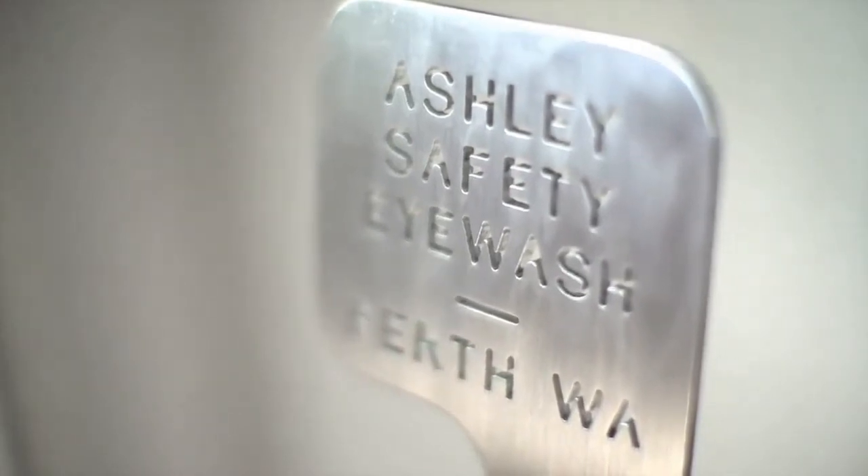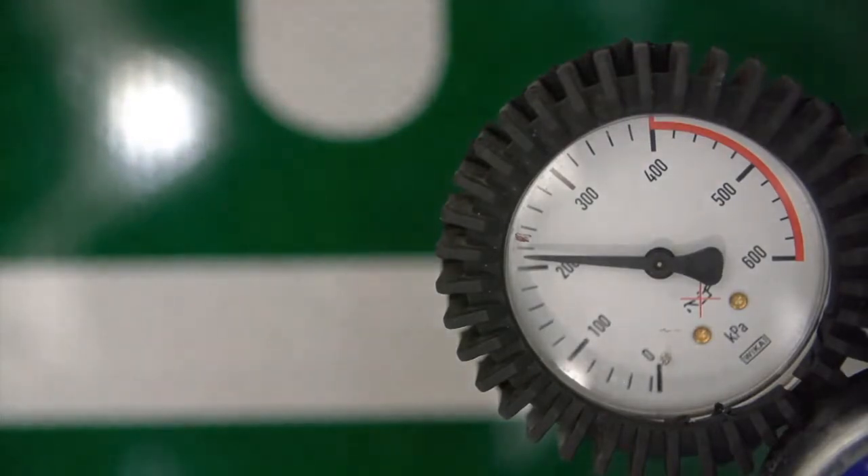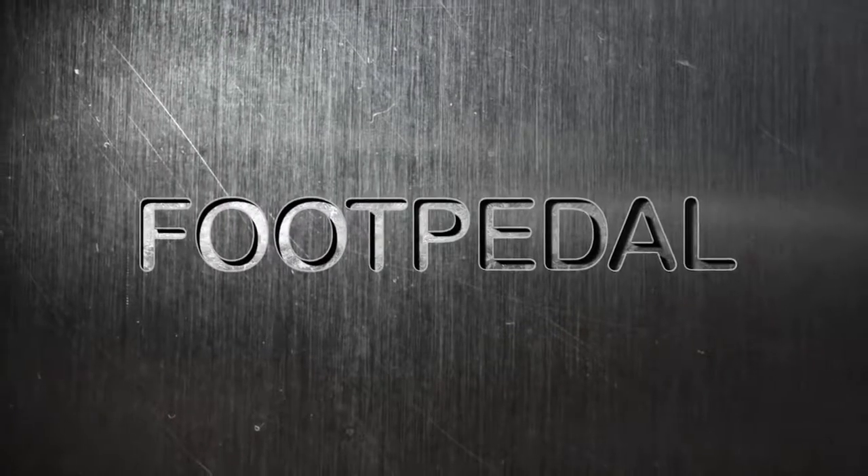In order for this test to be fair, we'll be using a controlled water pressure of 210 kilopascals across all five showers, as per American and Australian standards for safety showers and eye washes. Let's get started.